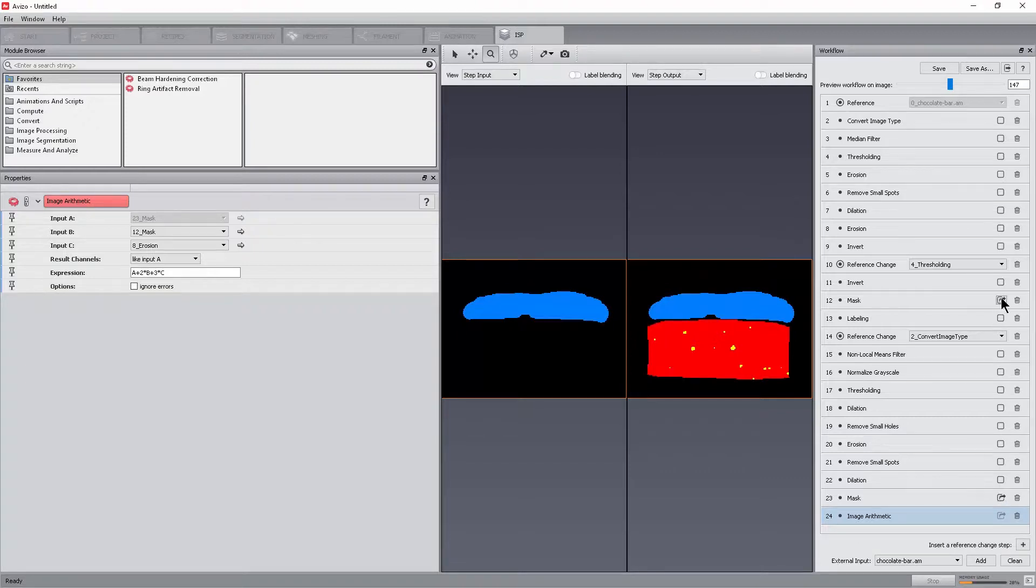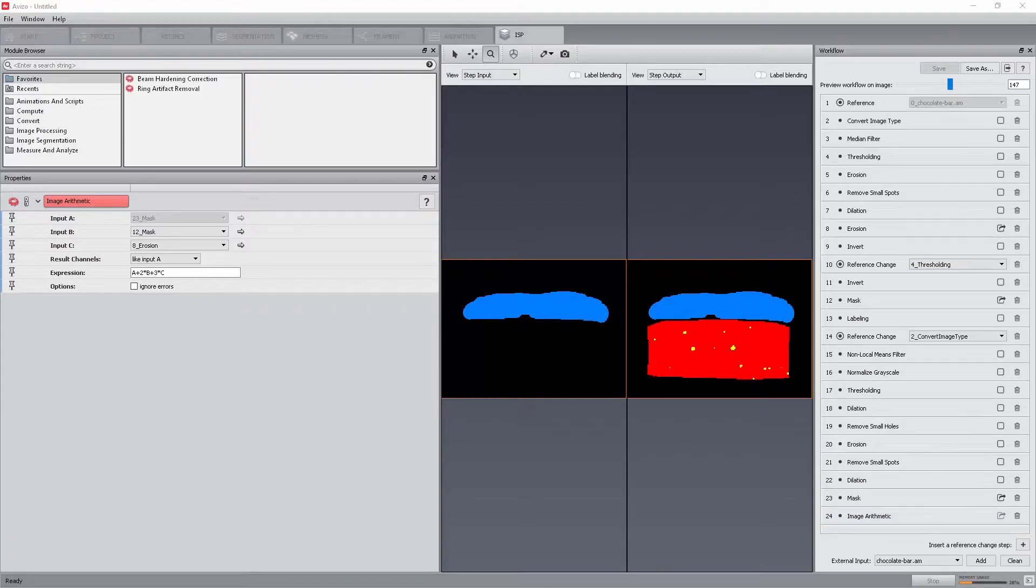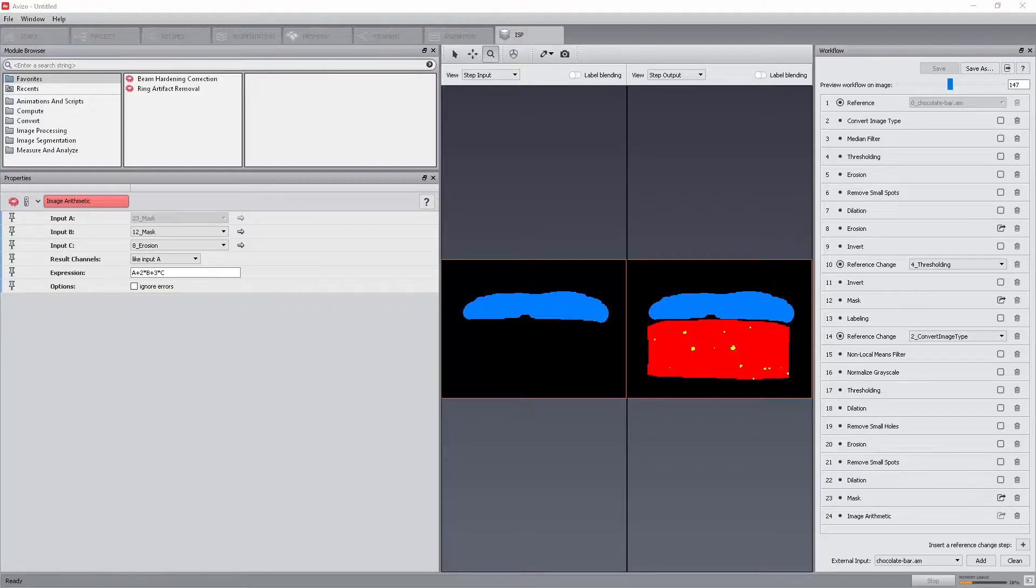When the image stack processing module is executed from the main project workroom, the module outputs the last step of the image stack processing recipe and the data that are selected as additional outputs in the workroom.